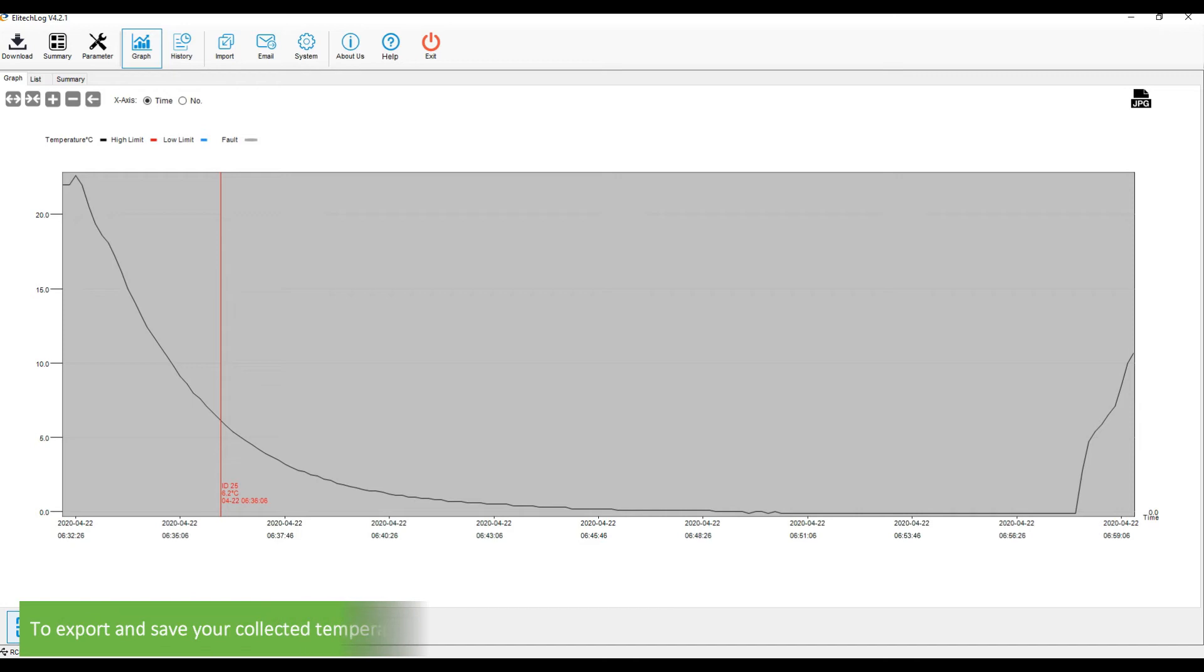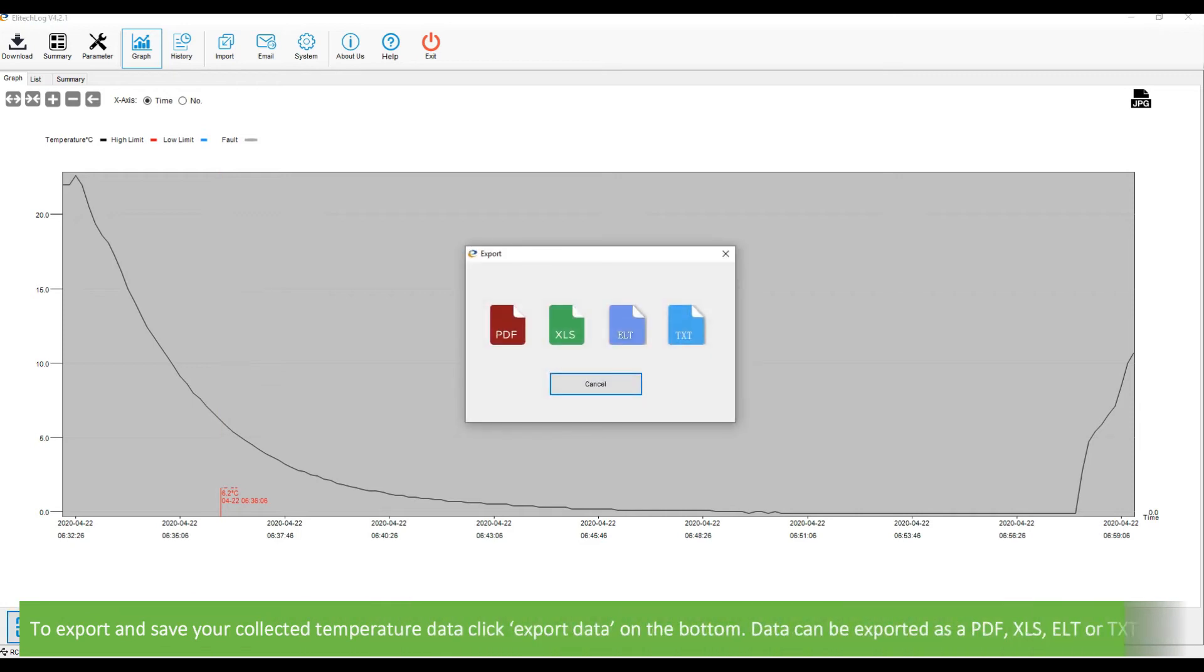To export and save your collected temperature data, click export data on the bottom. Data can be exported as a PDF, XLS, ELT, or TXT file.